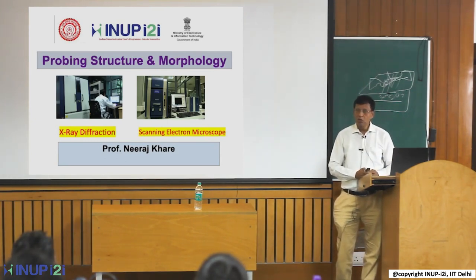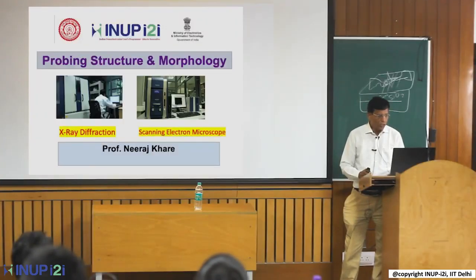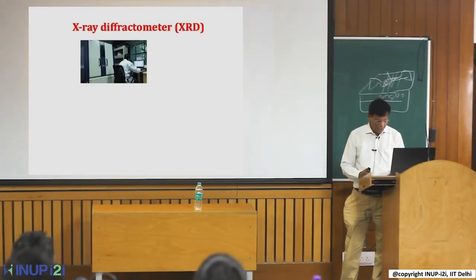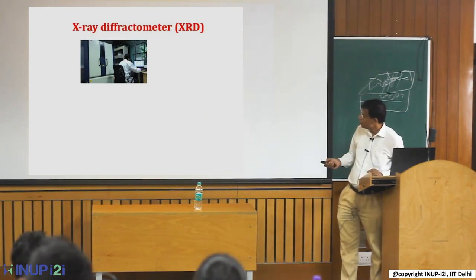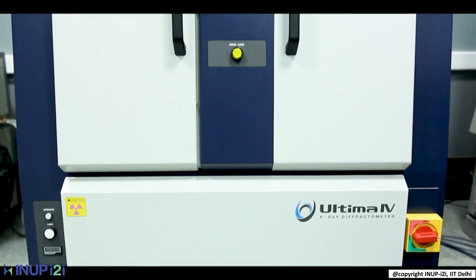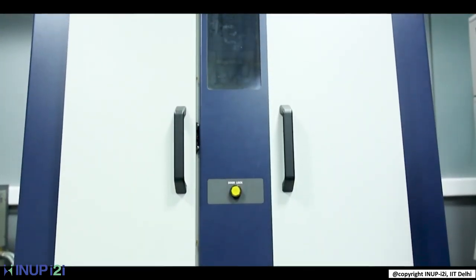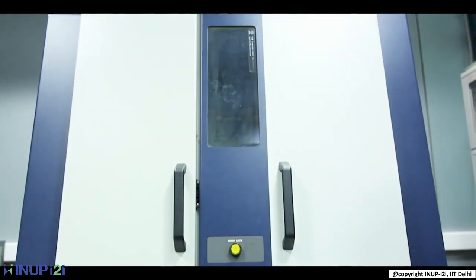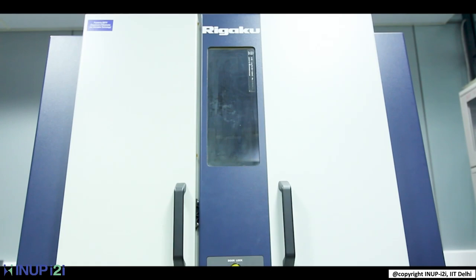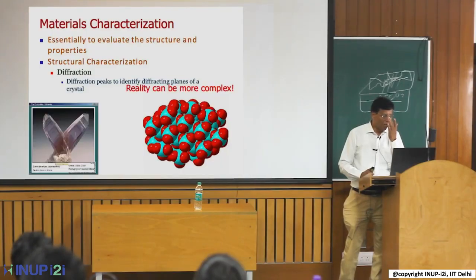We may not be able to answer everything today; tomorrow we also have an interaction meeting where we will talk in more detail. First, I will start talking about the X-ray diffraction facility. This photograph shows the XRD tool we have here in the Nanoscale Research Facility — the model name is Altima.